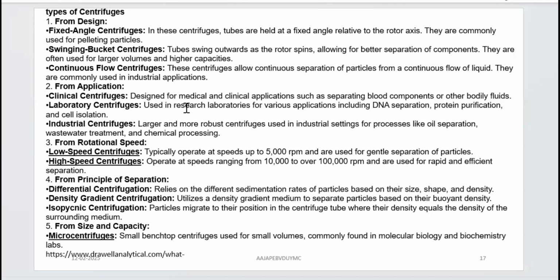Now, when it comes to the centrifuge, the rotor is the main component we have seen, because the type of rotor is going to have an effect on the sedimentation and the application of the centrifugation process. So you have to choose an appropriate design of a rotor so that the desired centrifugation process can be efficiently completed. So why and how I'm saying this, how it would be working, that we have to discuss.